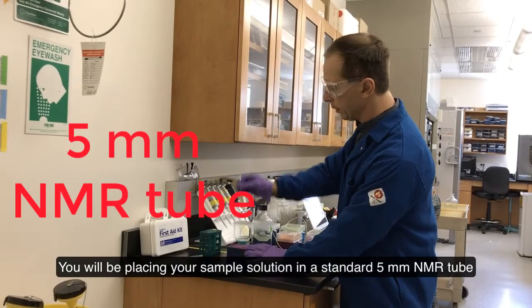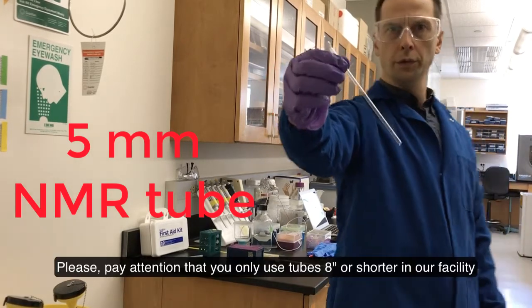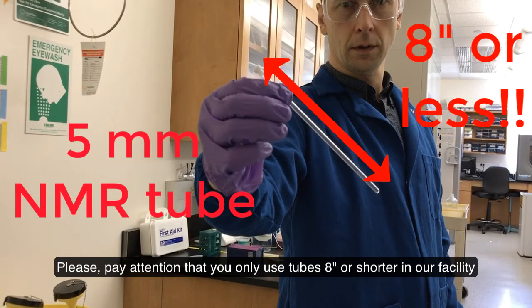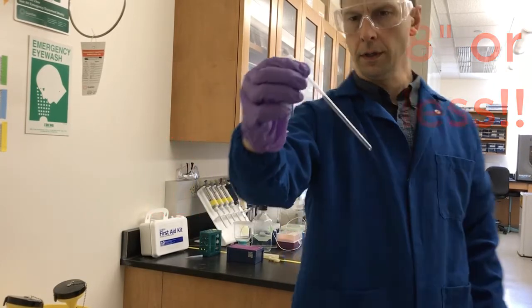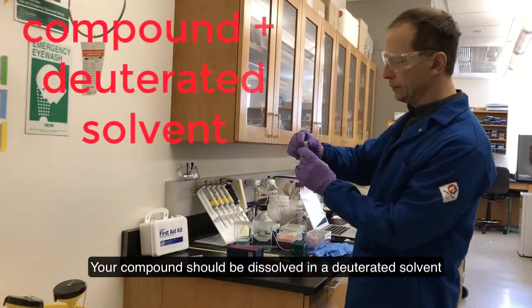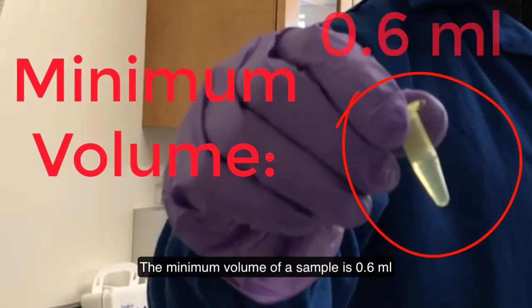You will be placing your sample solution in a standard 5 mm NMR tube. Please pay attention that you only use tubes 8 inches or shorter in our NMR facility. Your compound should be dissolved in a deuterated solvent. The minimum volume of a sample is 0.6 ml.